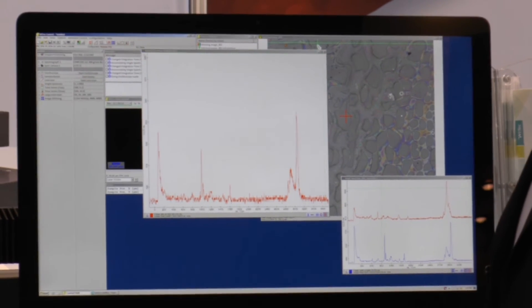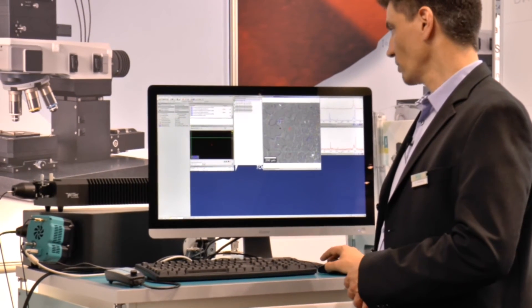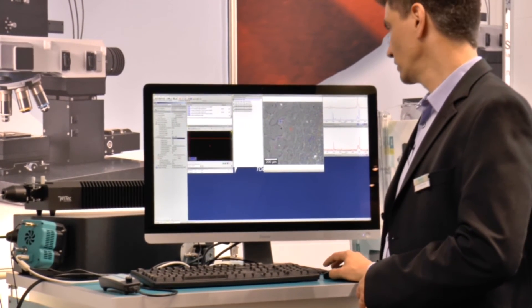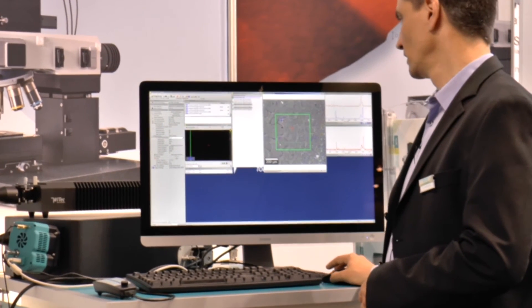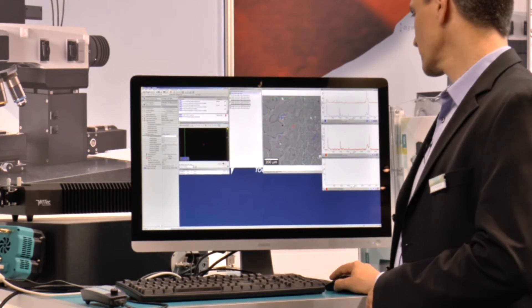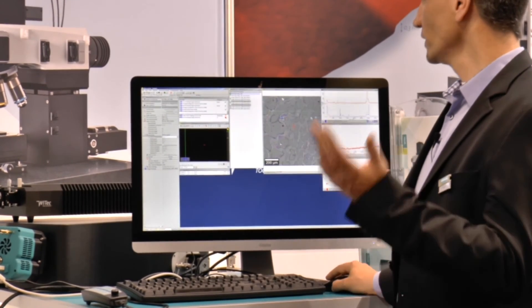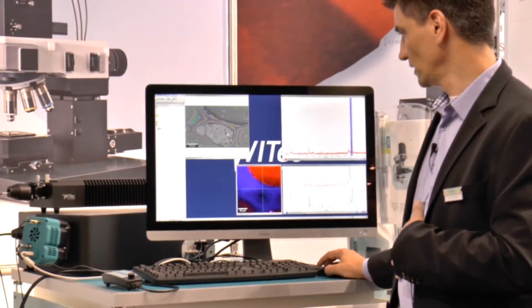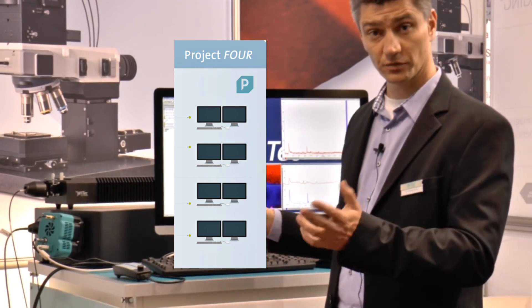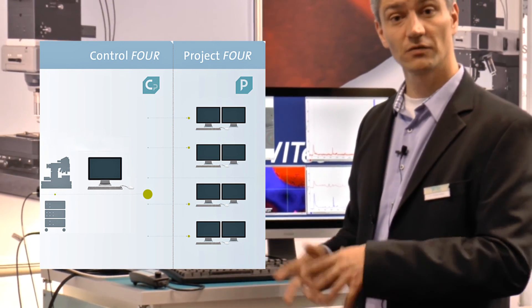Imaging is also possible with the system. Within the video area we can choose where to perform an image scan. Going to the large area image scan, I choose the area of interest and hit 'start large area scan'. It performs the scan, recording a spectrum at every position — you can see it change bit by bit. The system, like all VTEC systems, comes with two software packages: control software for data acquisition and project software for data evaluation, both license-free for all users of the system.